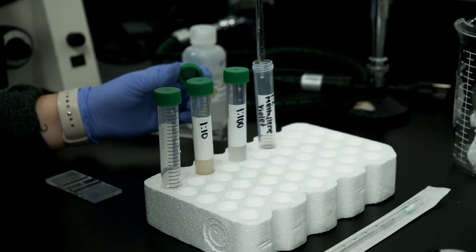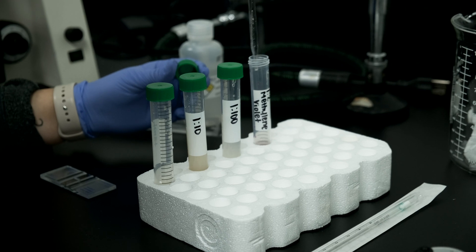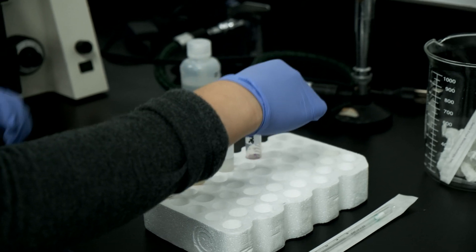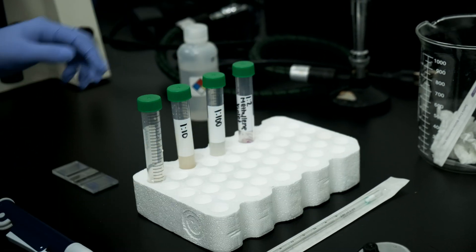Now transfer 1 milliliter of your diluted sample into a new conical tube. Transfer 1 milliliter of your stain into the same tube, creating a 1 to 200 dilution.